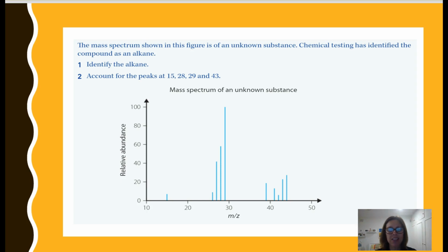That is leaving us with the CH3 and CH2 remaining. A peak at 28 is an extra loss of a hydrogen there, so that would bring me back to a CH2. And our peak at 15 is a CH3 ion on its own, so therefore we've lost the CH3, CH2.